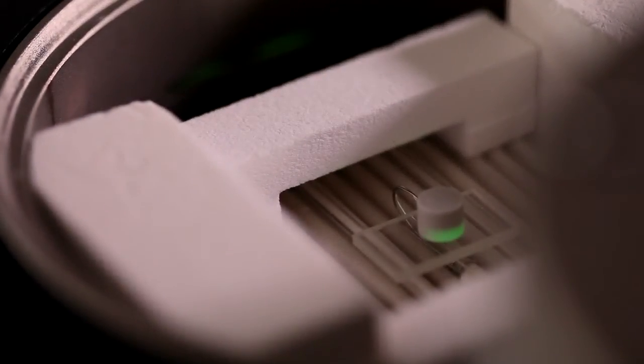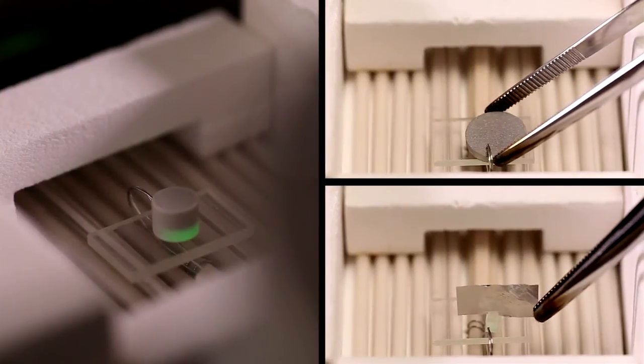And non-contact optical technology unlocks ultimate sample and experimental flexibility.